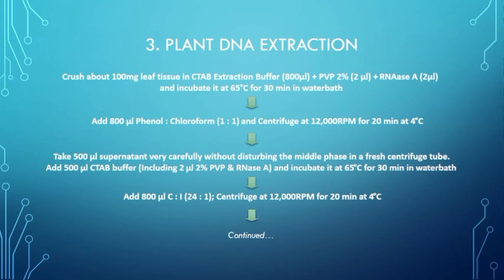Any sample, if you are doing it with bacteria or fungi, a larger amount will take a great amount of this extraction buffer, and you will not actually use all that DNA you will find in the end, because our goal is to do sequencing, and you can do sequencing after getting 400 or 500 nanogram of DNA. With 10 to 100 milligram of sample you can easily get that amount of DNA, which you will need to do PCR.